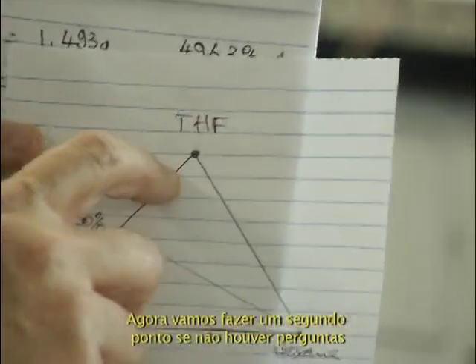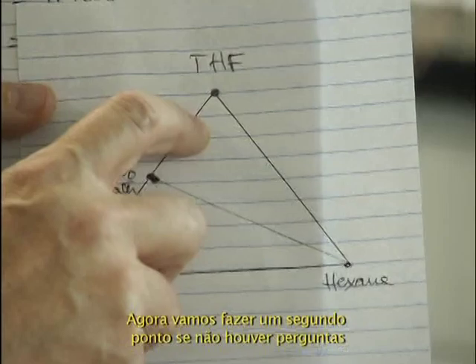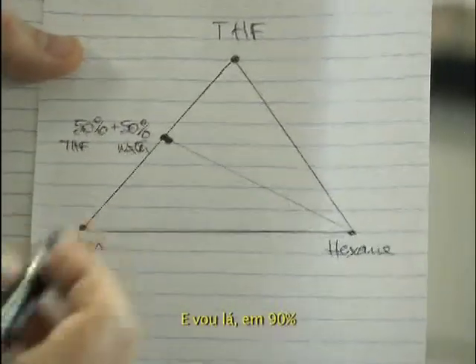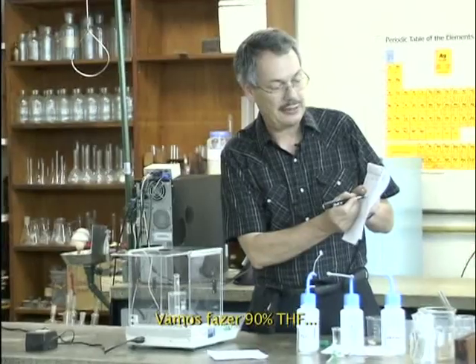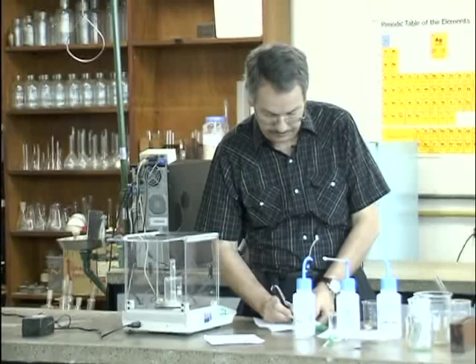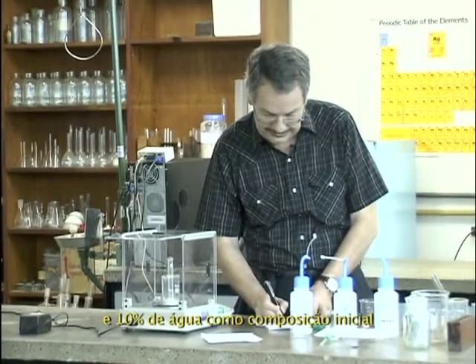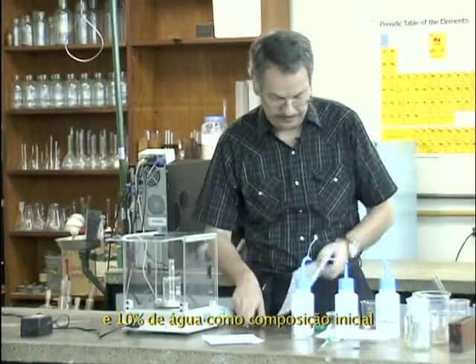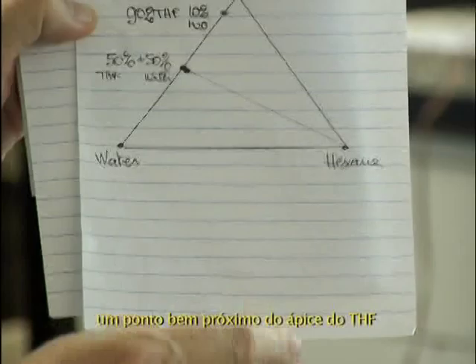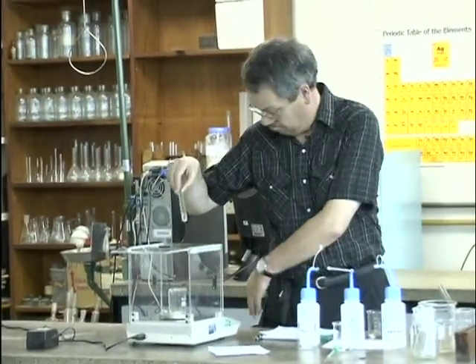Okay, so now I'll make a second one if you have no question. And I will go there on 90%. Let's make 90% THF and 10% water as initial composition. A point very close to the THF apex. Let's save this one.